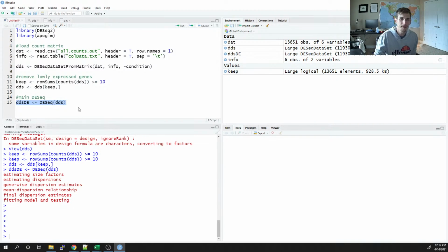And that's not a bad thing to do, because I kind of break down my DESeq stuff into two steps: running the program and exporting the files of interest, and then doing some graphics with those exported files. So I will want the normalized read count from my DESeq stuff.